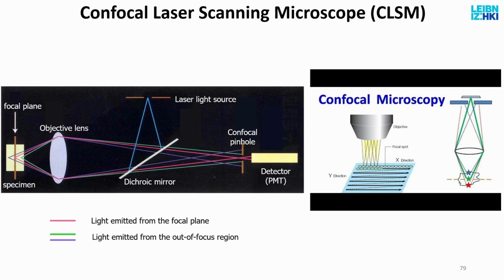But lasers make very small spots, maybe a micron after focusing. So I get signal from 1 cubic micron, 1 by 1 by 1 approximately. I don't see my whole sample. So what I have to do is scan the sample. I have to move the laser beam in the X, Y, and Z directions.